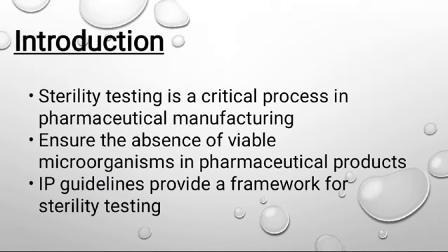Introduction. Sterility testing is a critical process in pharmaceutical manufacturing to ensure the absence of viable microorganisms in pharmaceutical products. IP guidelines provide a framework for sterility testing.